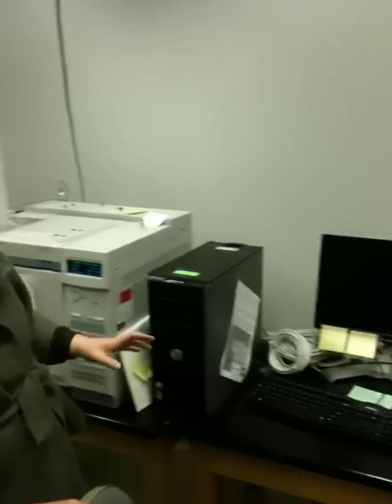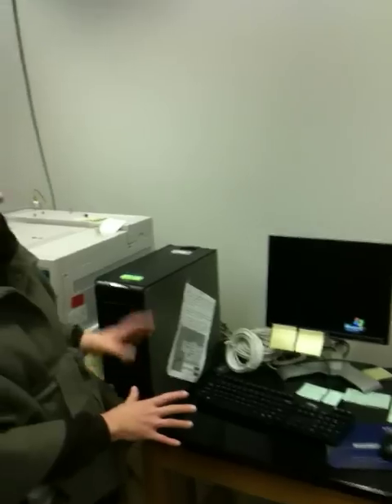Just getting familiar with the station: this is the computer that runs the instrument right here, the screen, the keyboard, and this is the printer for the instrument.